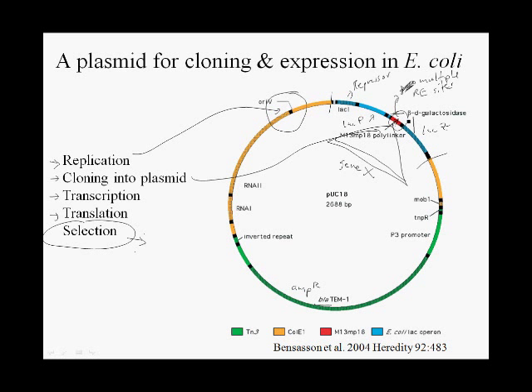So there is actually a test using a dye where cells that contain functional beta-galactosidase turn this dye blue, and you get blue colonies. And cells that contain a disrupted or non-functional beta-galactosidase gene are unable to act on the dye and remain white. So this is called blue-white screening.